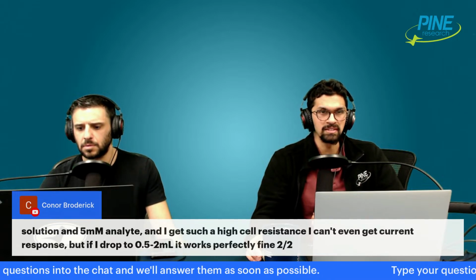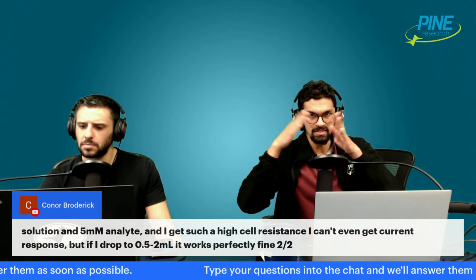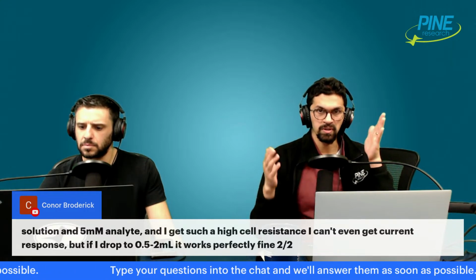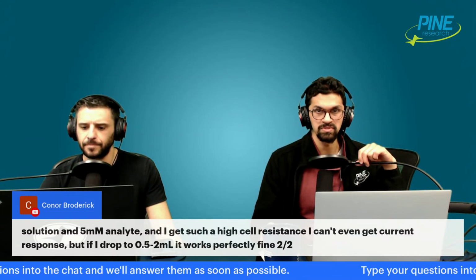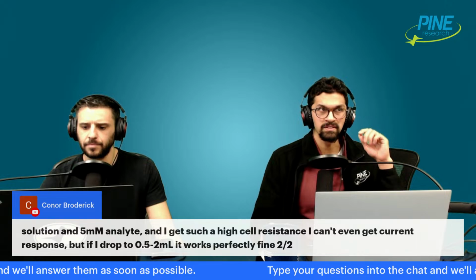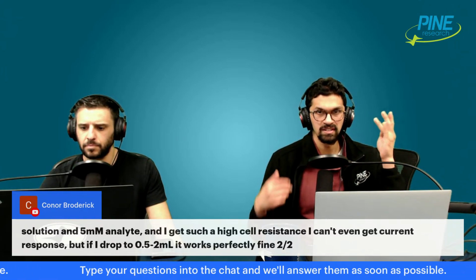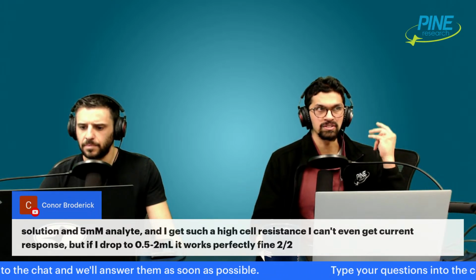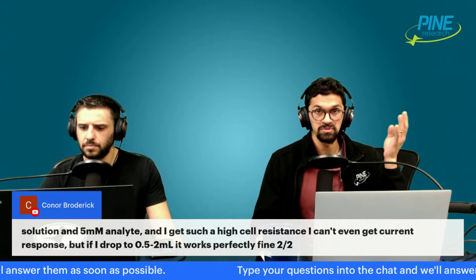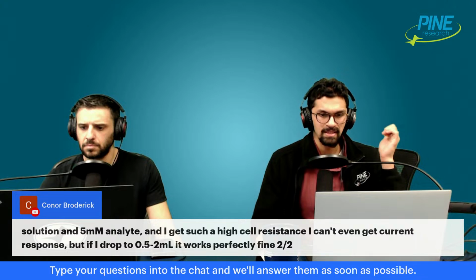But generally speaking, it is the electrical contact, the distance between the reference and the working electrode, that creates what we call uncompensated solution resistance. If there's not that many ions between those two and it's very resistive, it's very hard for your experiment to happen. At the same time, your counter electrode has to drive current through the cell, and you may be running into a compliance voltage issue.